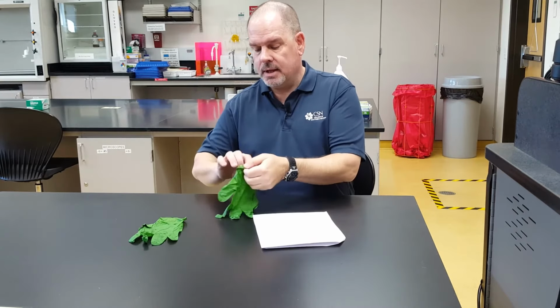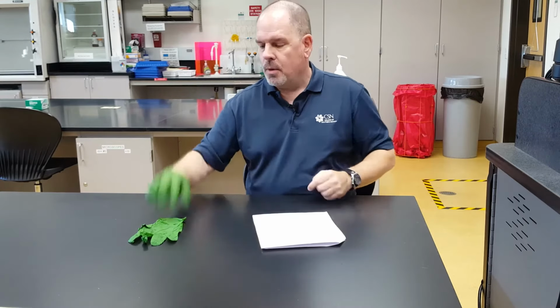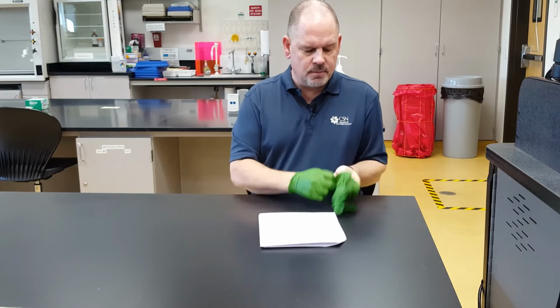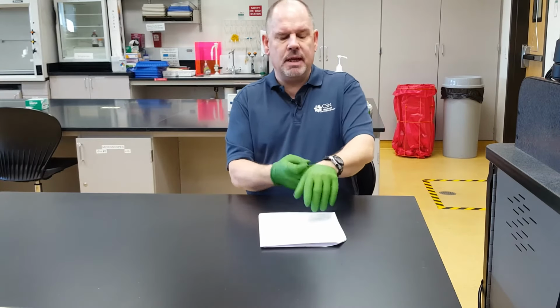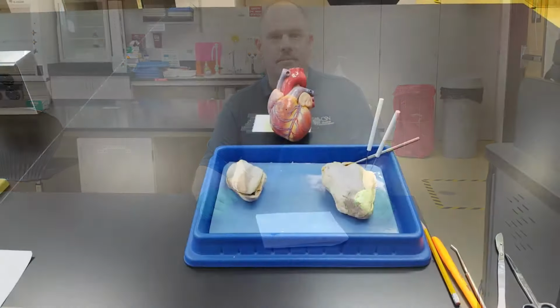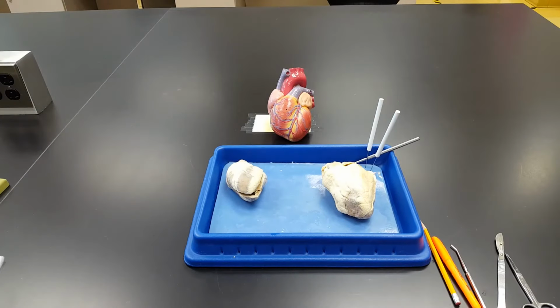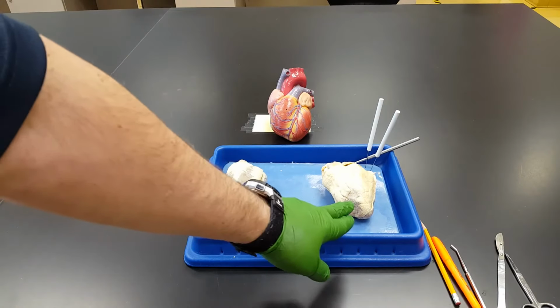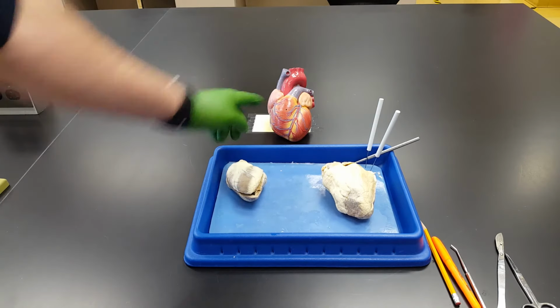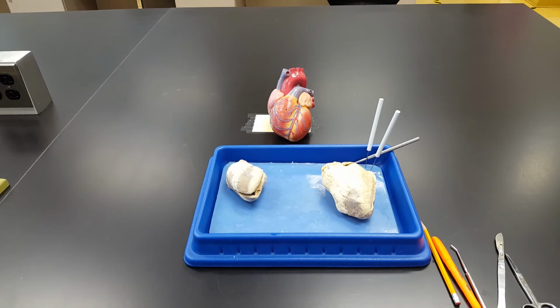So, without further ado, why don't you, at least in the figurative sense, glove up with me and let's cut up some dead stuff. So what we're looking at here are two sheep hearts, one rather larger, one rather smaller sheep heart, and I threw in a heart model right there in the same exact orientation.